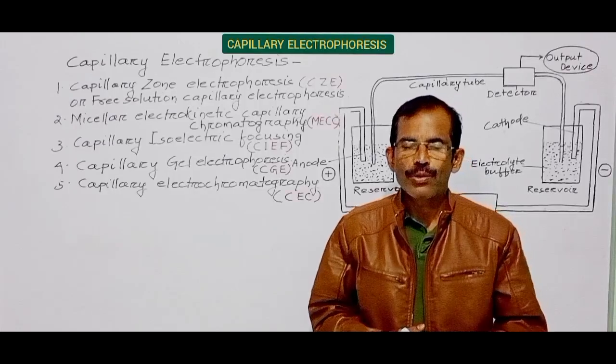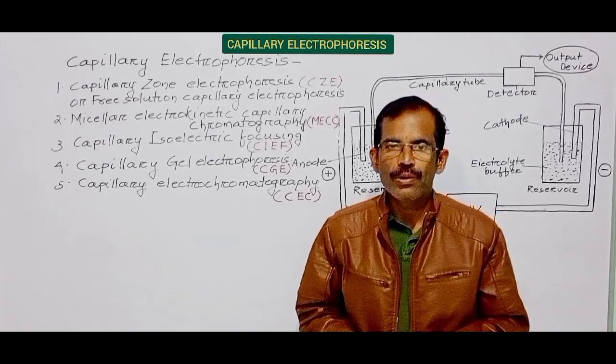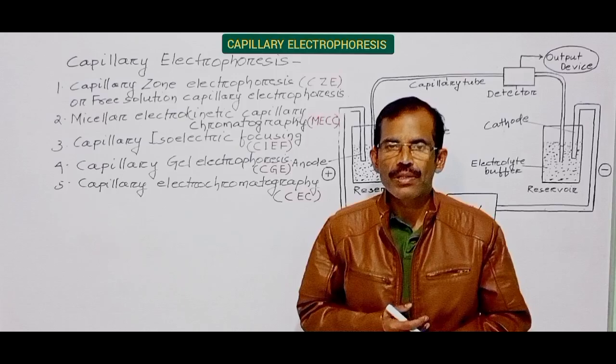Good evening friends. Today we shall discuss capillary electrophoresis.